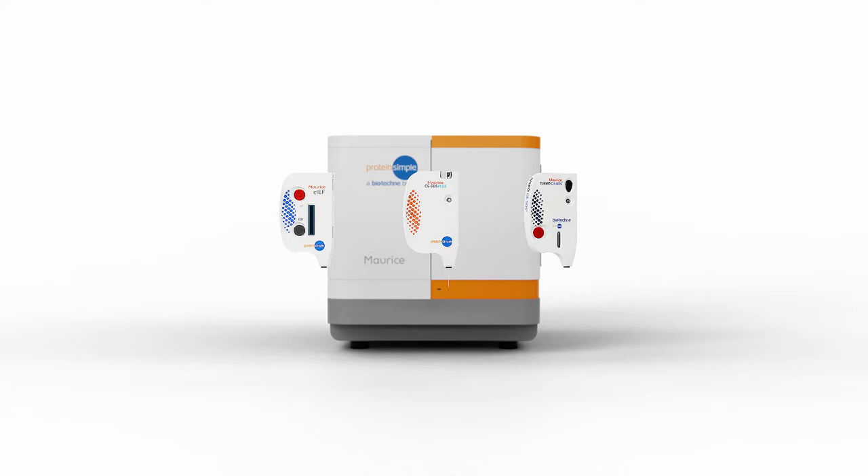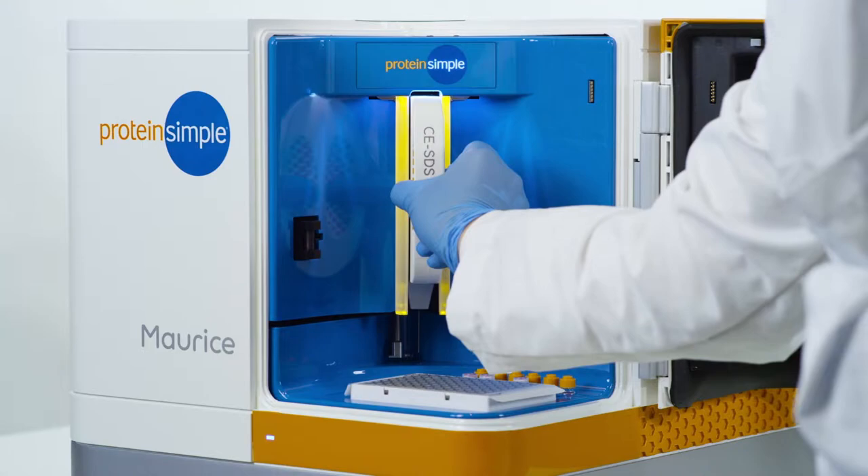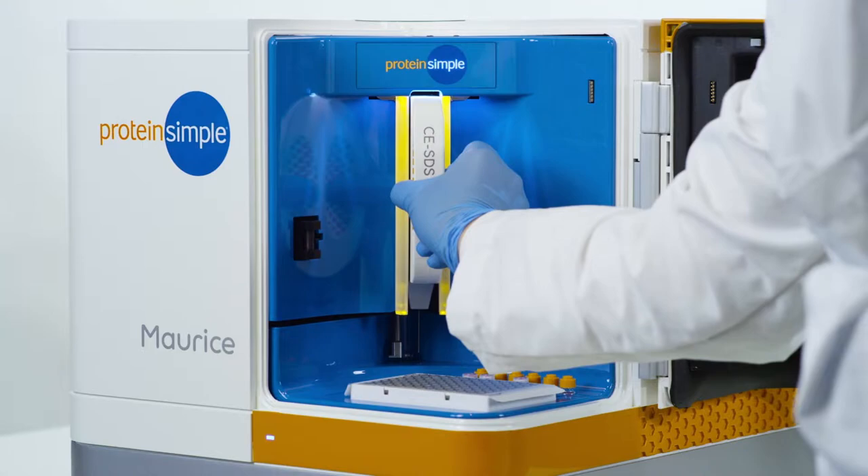Maurice saves you time. He makes it quick and easy to switch between CIEF and CESDS detection. Just pop out one cartridge and pop in the next. You don't need to waste time cleaning the system in between.